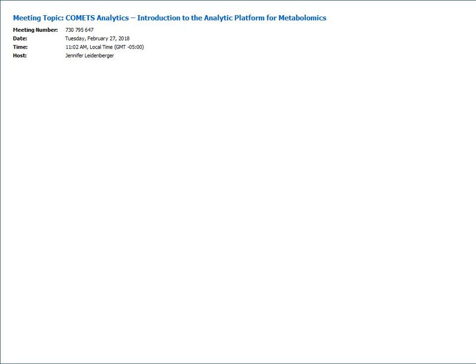The next question is, do you use a universal chemical identifier to map the metabolites across platforms? If so, what do you use? Is the harmonized metabolite database publicly available? All right, I'll take this one. There are approximately 15 different labs contributing to COMETS cohorts, and at this point we're only selecting cohorts with identified metabolite data.